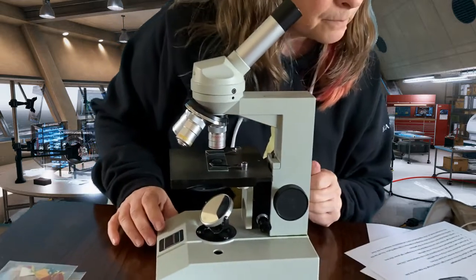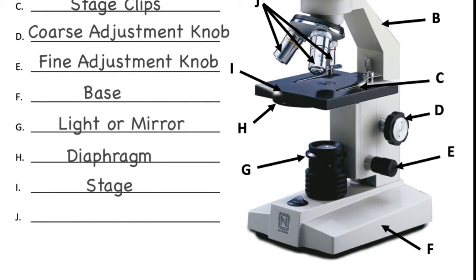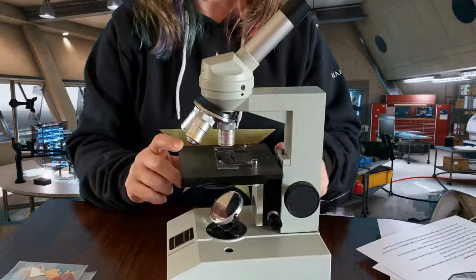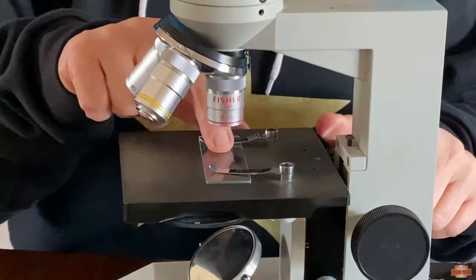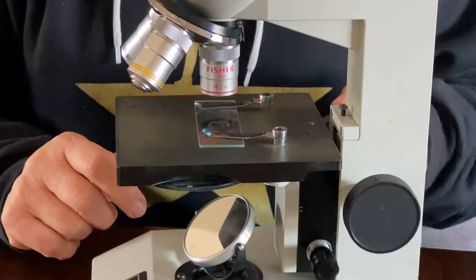Okay, that was H. I is the stage. What we were talking about before, it moves up and down. That's where you put the stage clips, and you put the slide on that.